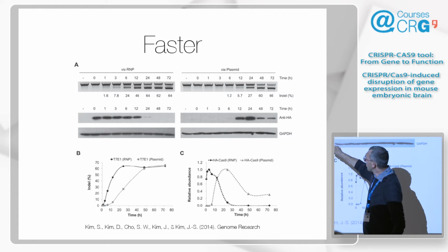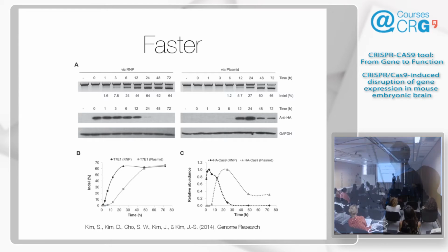But anyway, already after a very short time, after 1 hour, you see at least a little bit. This is the percentage of indels. You see 1% after 1 hour. And you wait a little bit, like 6 hours, and there's already a significant amount in the cell culture. Whereas with plasmid, there was a big delay. And I always wondered, you have this big delay, and in this case, it's just an indel. But what if you want to do repair? Your repair template, is it hanging around for 6 hours doing nothing, or is it rearranging and integrating all over the place? So this is always a good idea.